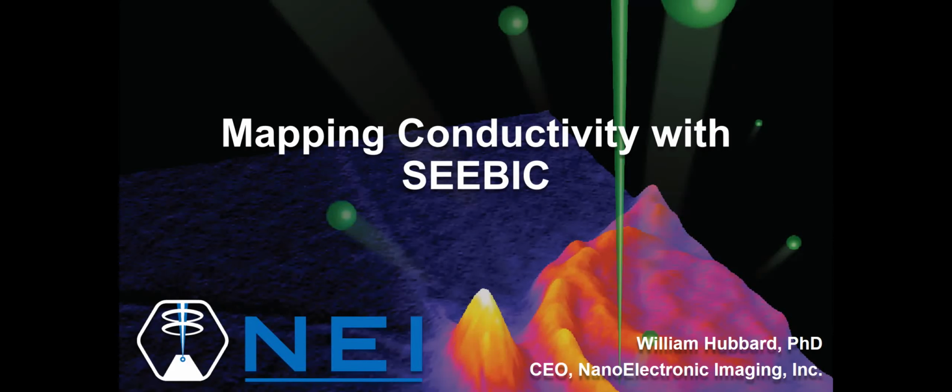In this video, we're going to talk about one of the more exciting capabilities of NEI's STEM EBIC system, and that's the ability to map conductivity at high resolution with SEEBIC.